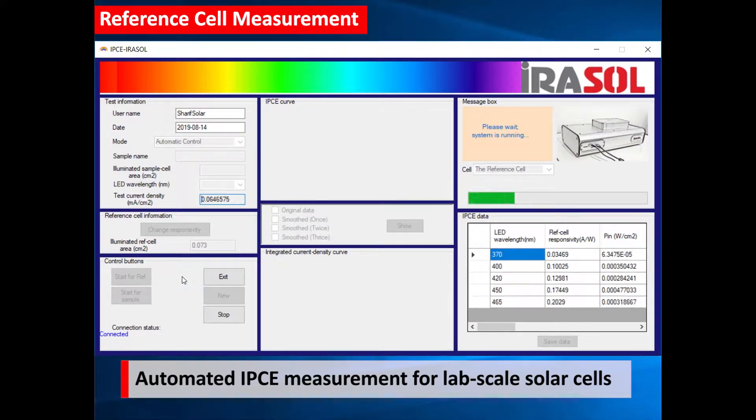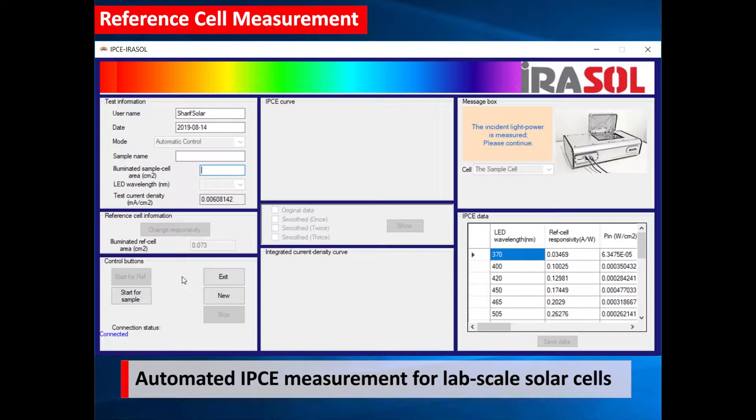First, the stage is placed in reference cell position to start the measurement of reference cell. The reference cell data is automatically saved for IPCE calculations later.